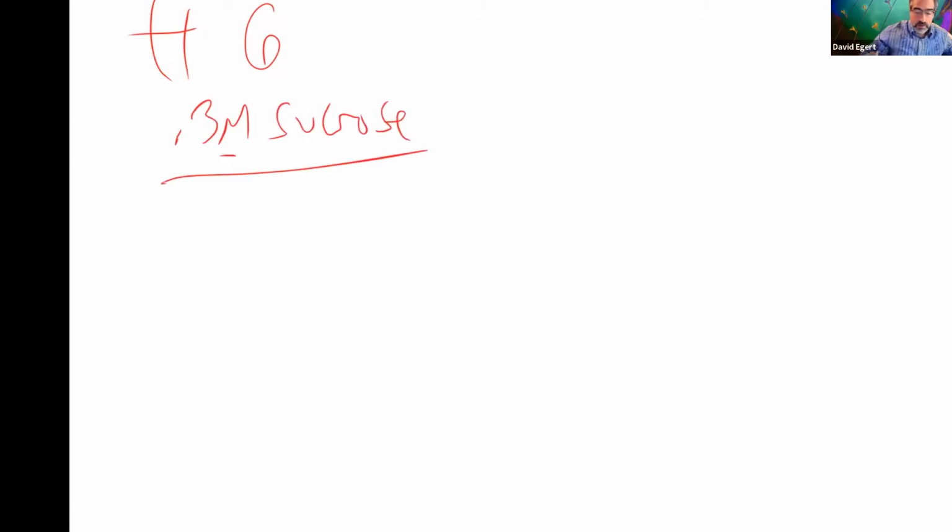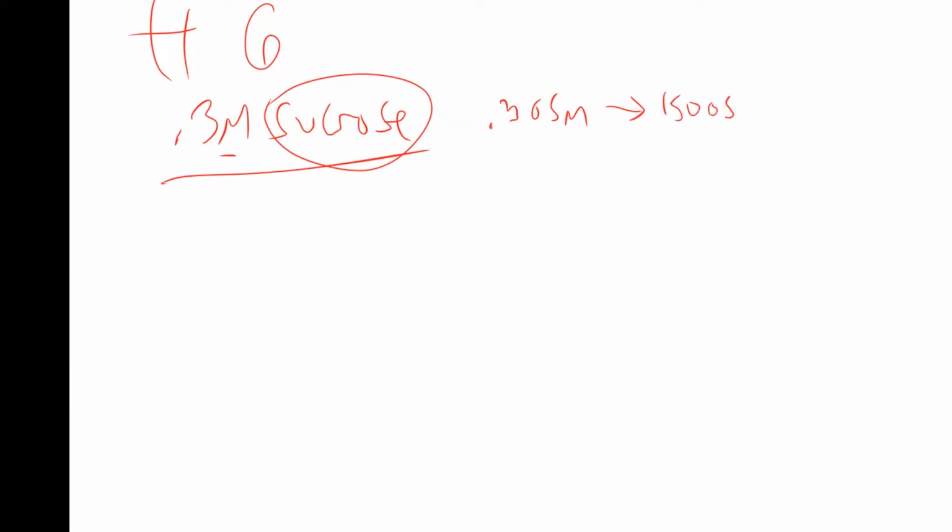And then the next one I did with sucrose. Again, what is the osmolarity of 0.3 molar sucrose? It's going to be 0.3 osmolar because it doesn't dissociate. Is sucrose penetrating or not penetrating? Not penetrating. It's a big polar molecule, a large polar molecule. So it's isoosmotic.